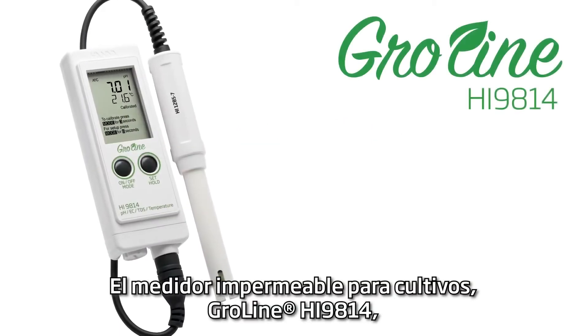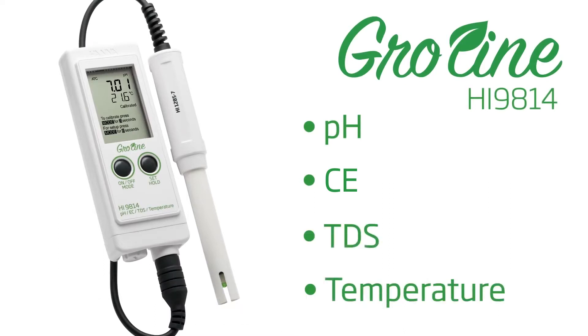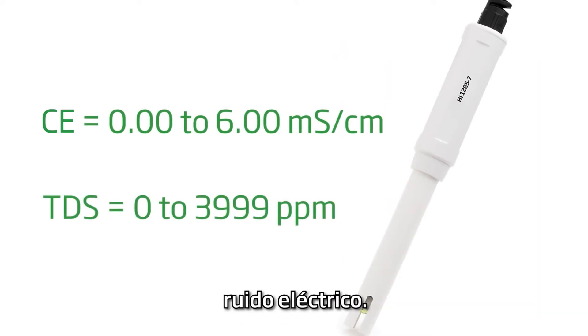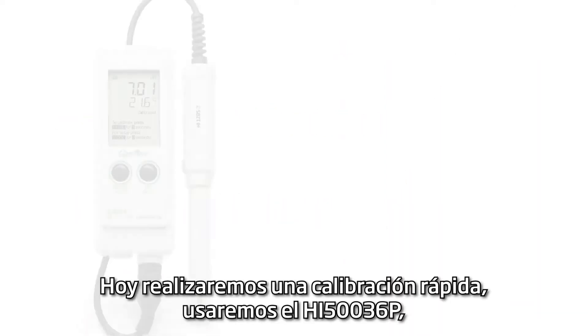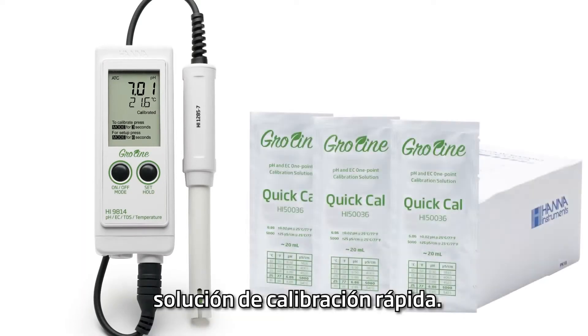The HI9814 GroLine Waterproof Meter measures pH, conductivity, total dissolved solids, and temperature with a single-amplified probe that is immune to interference from humidity and electrical noise. Today, we will be performing a quick calibration using the HI50036P quick calibration solution.